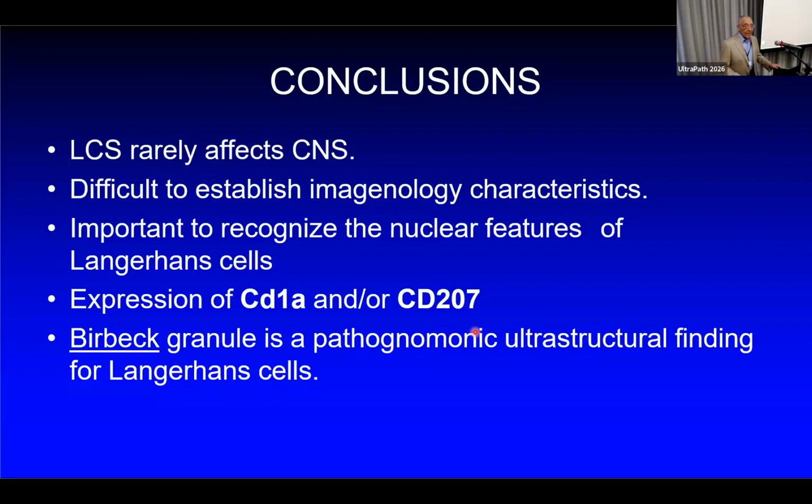Well, that was just a few examples of how the fine ultrastructure can be preserved, or sometimes is not as well preserved. I should recognize that it is possible to have good preservation and make a diagnosis, and especially make correlative studies of molecules or whatever with electron microscopy.